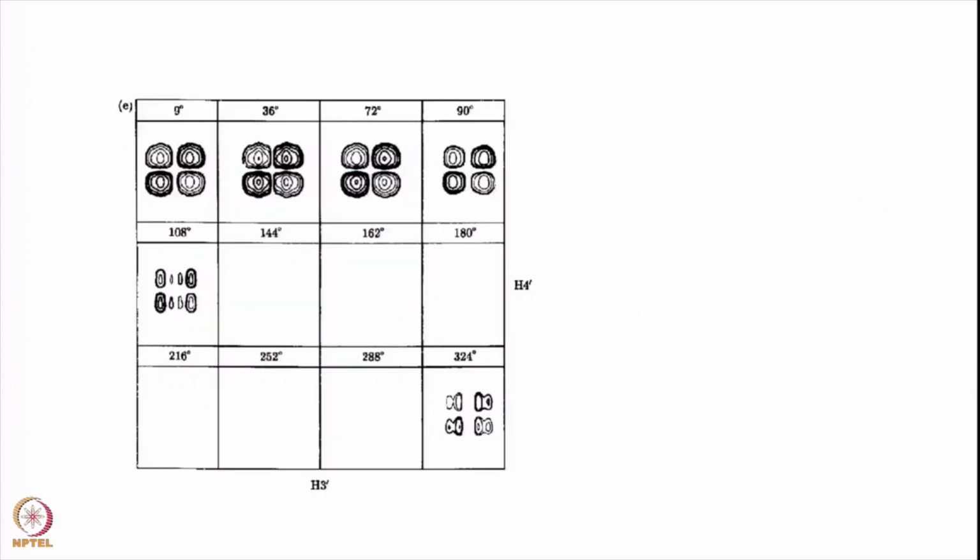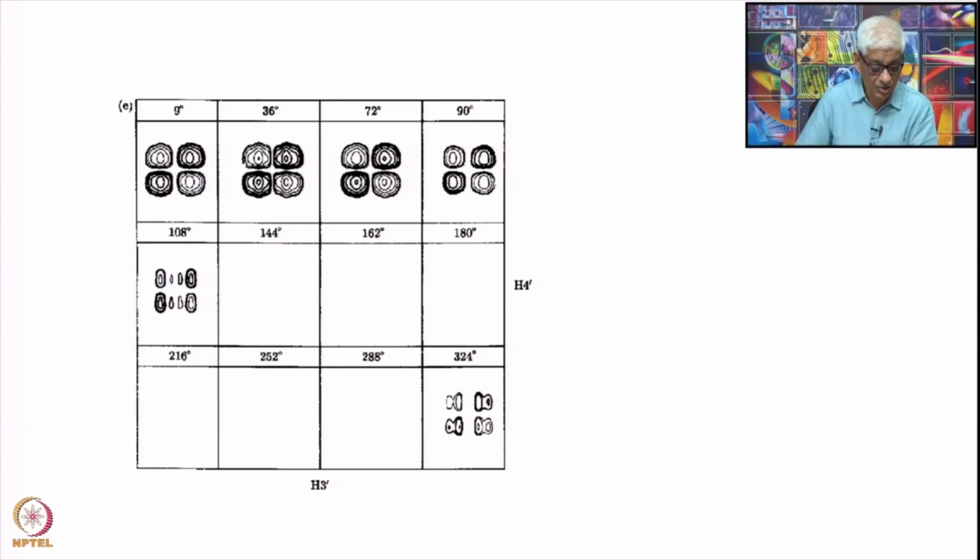Okay. Now this is for the 3' 4' peak. You see that in the C2' endo geometry region the 3' 4' coupling is 0. It is very strong in the C3' endo geometry, that is in the northern region. The 3' 4' coupling is very large, therefore you will see a very strong cross peak. This is for the COSY 90, not for COSY 45, and you will see a very strong peak only for these. The fine structures here will depend upon the 3' 4' coupling and the 3' 2' coupling, and those are the only two couplings present. You can calculate the fine structures based on the coupling constant values.